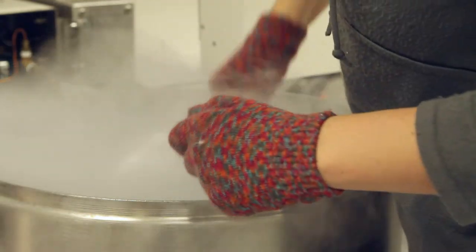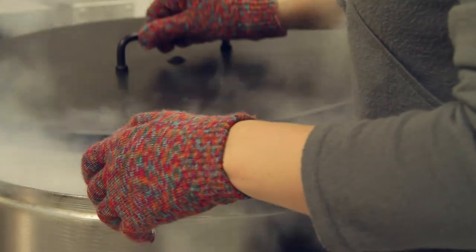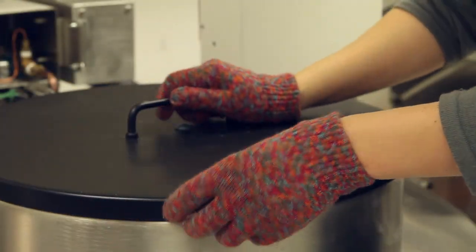We're in the forever business. We're keeping things for people to look at in 100 years. We need these tissues to last so people can ask questions. We don't know what technology is going to come up with.